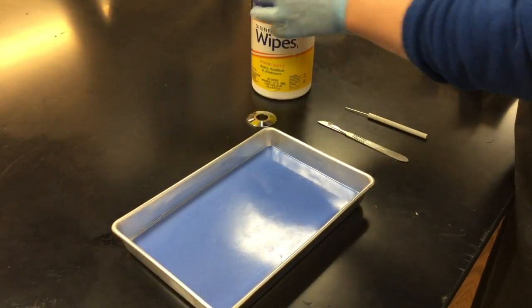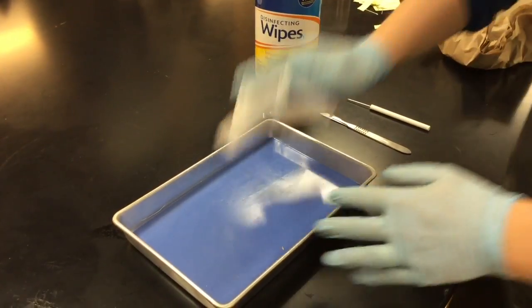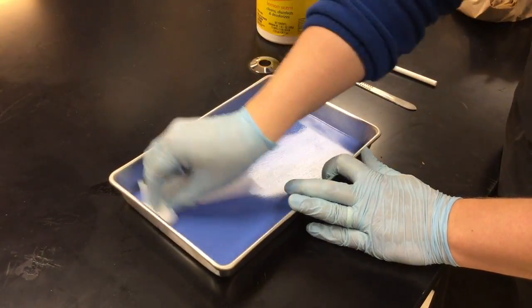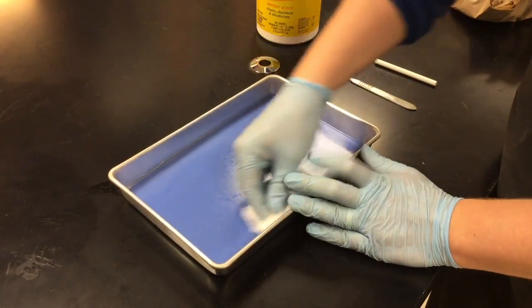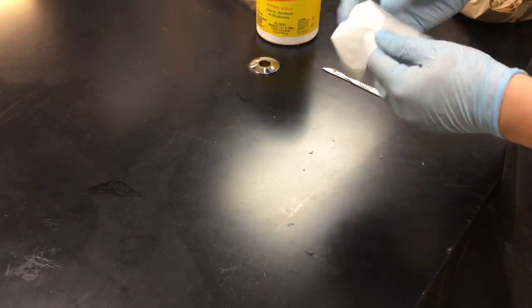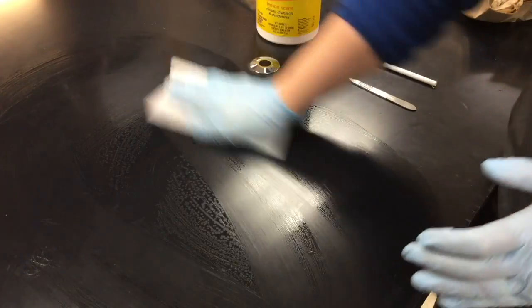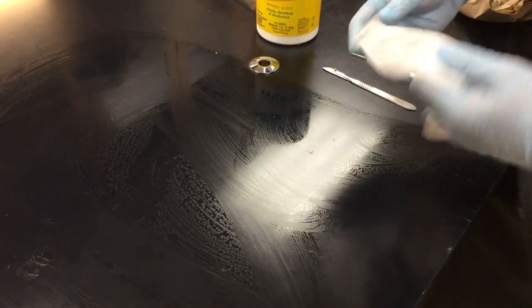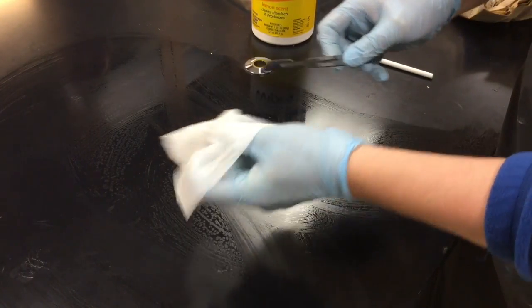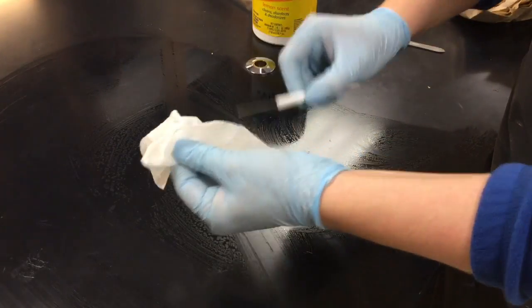After you are finished, you are then going to go ahead and take a cleaning wipe or cleaning spray. You want to wipe out the complete inside of your dissecting tray to make sure that none of those preservatives or chemicals are going to linger around. After you have wiped off your tray, you want to go ahead and wipe off the space where you worked. And also wipe off your dissection tools. So your scalpel, be very careful, and your dissecting probe.